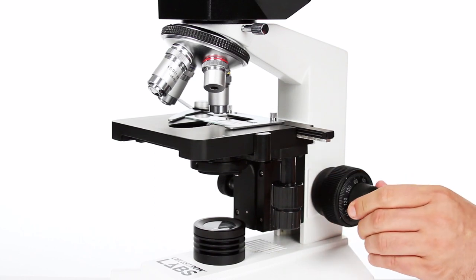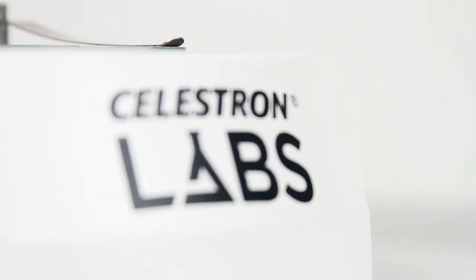The possibilities are endless. Choose your Celestron Labs microscope and begin your exploration.